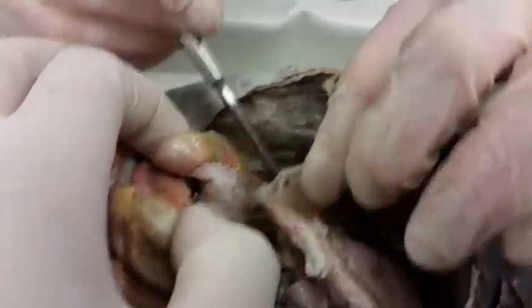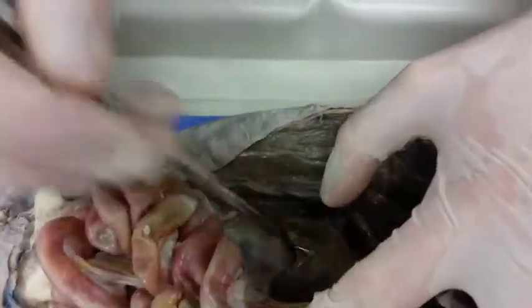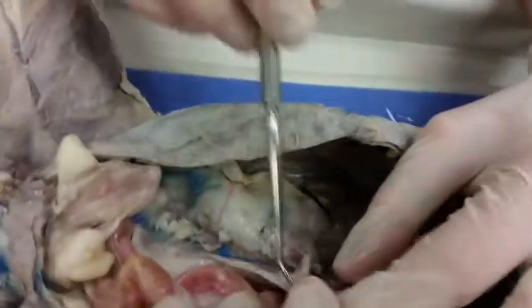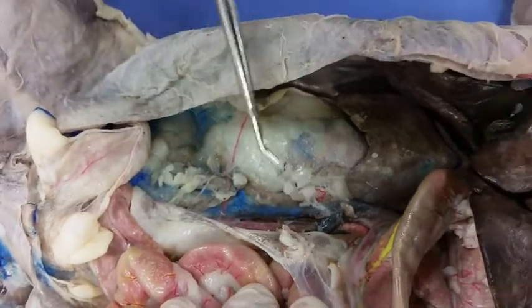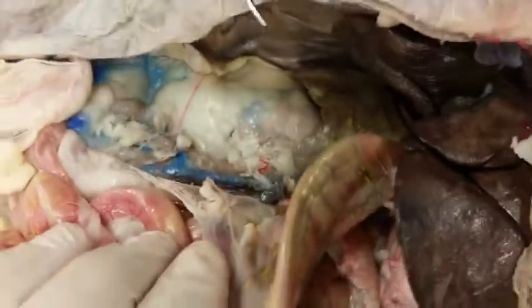We have back here, right there, this brown area that I'm running all over on. This is the caudate lobe of the liver. And then we have mesentery right here. More mesentery, mesoduodenum. Okay, so yeah. Duodenum, pancreas.